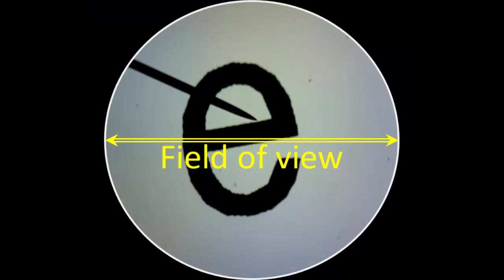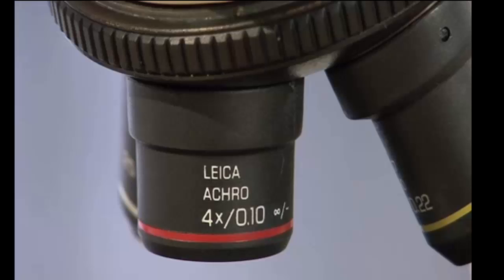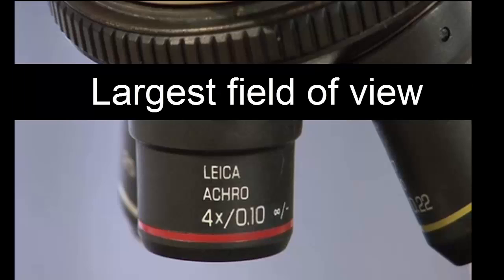This will help you find your specimen as you increase magnification because the microscope is par-centric, meaning that the image should stay relatively in the middle of your field of view as you change magnification. Notice, too, that the scanning objective provides the largest field of view.